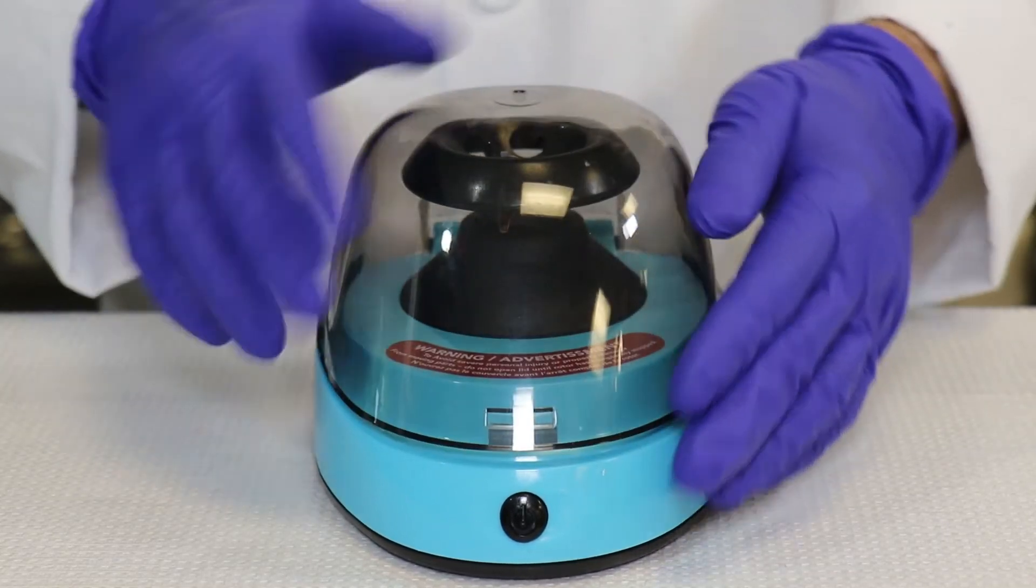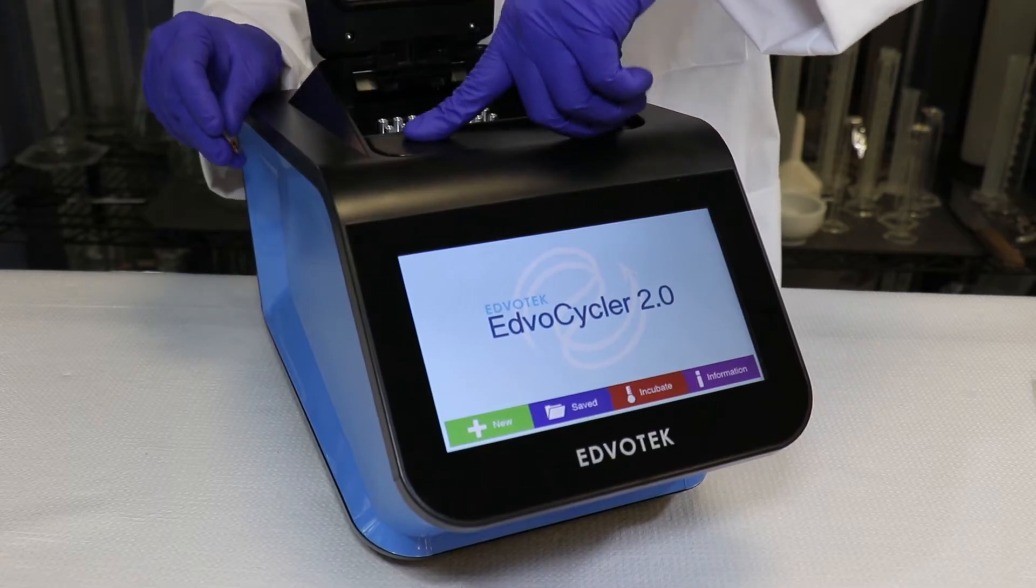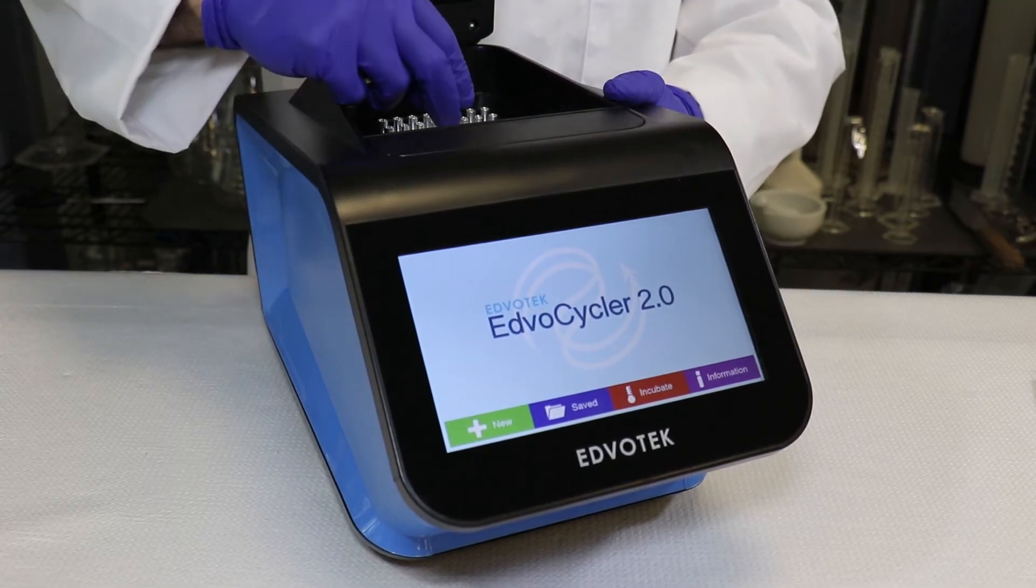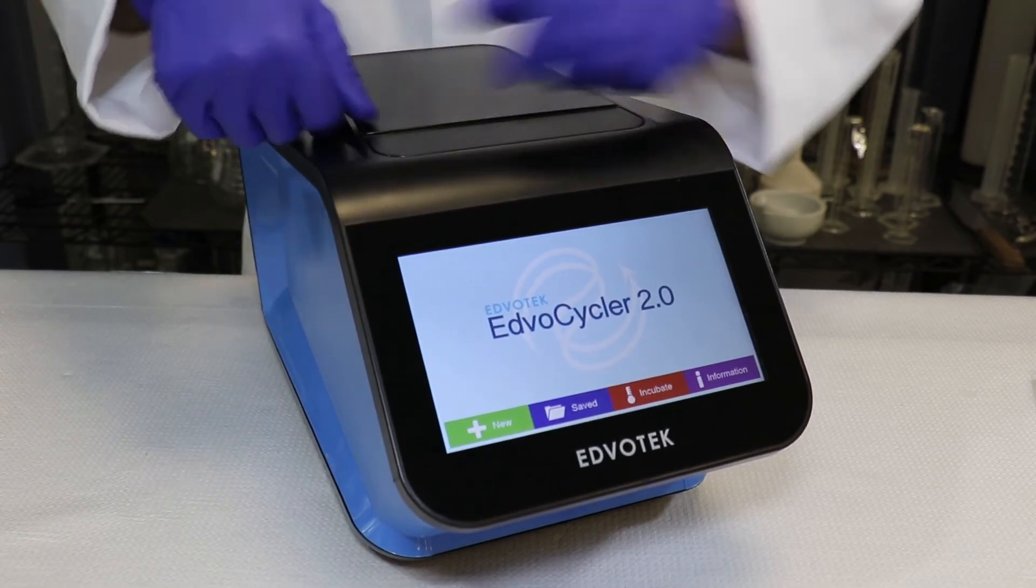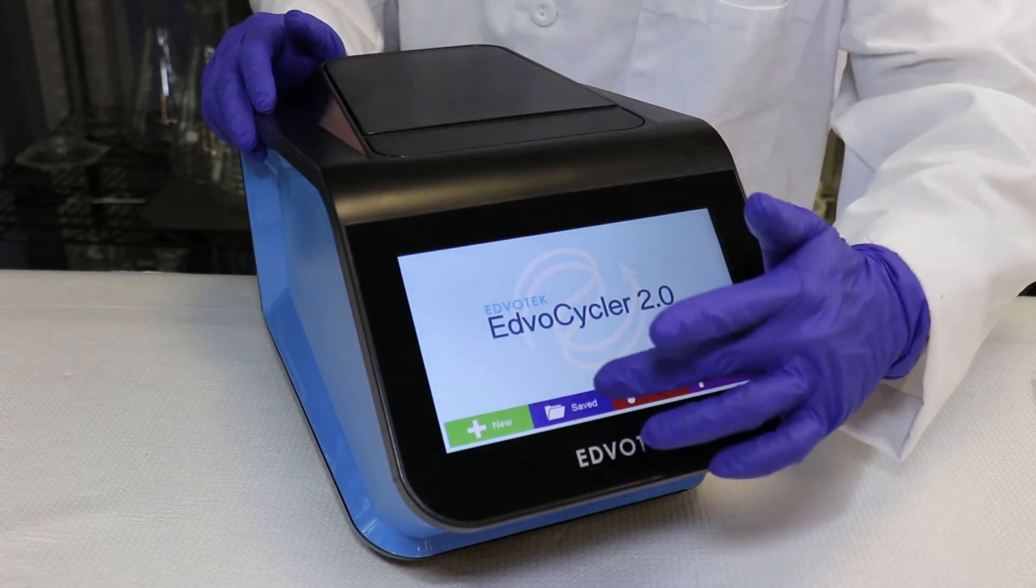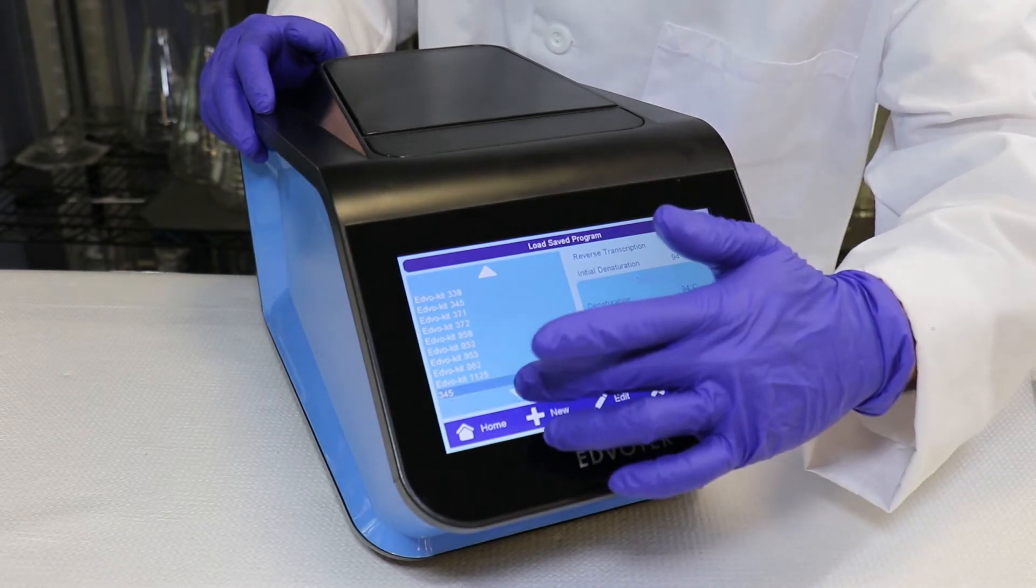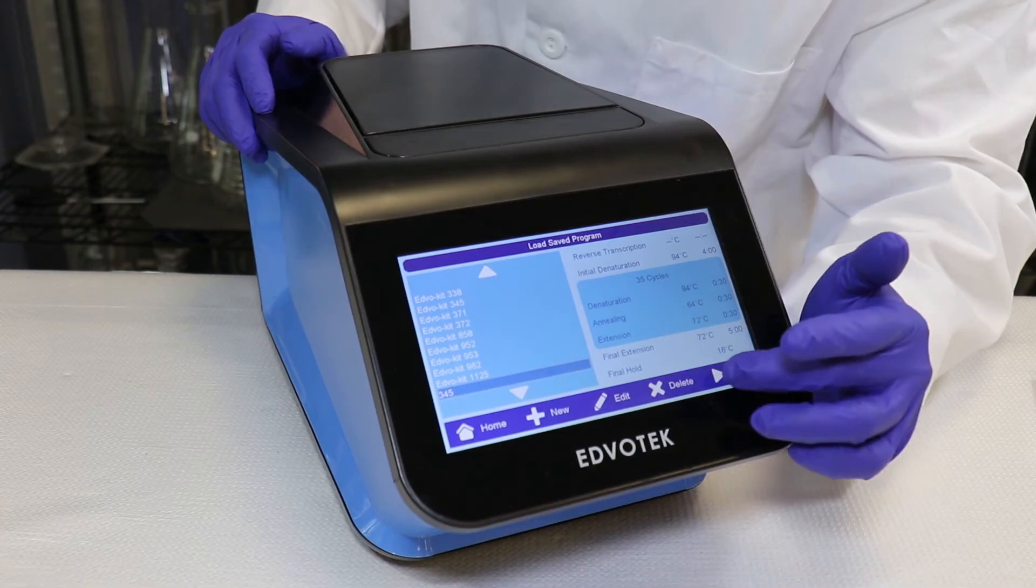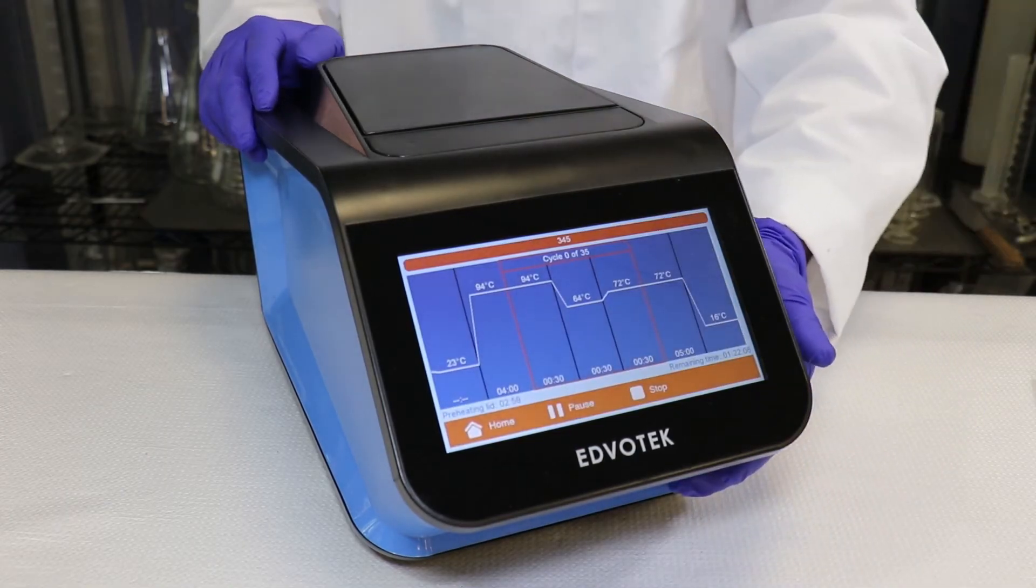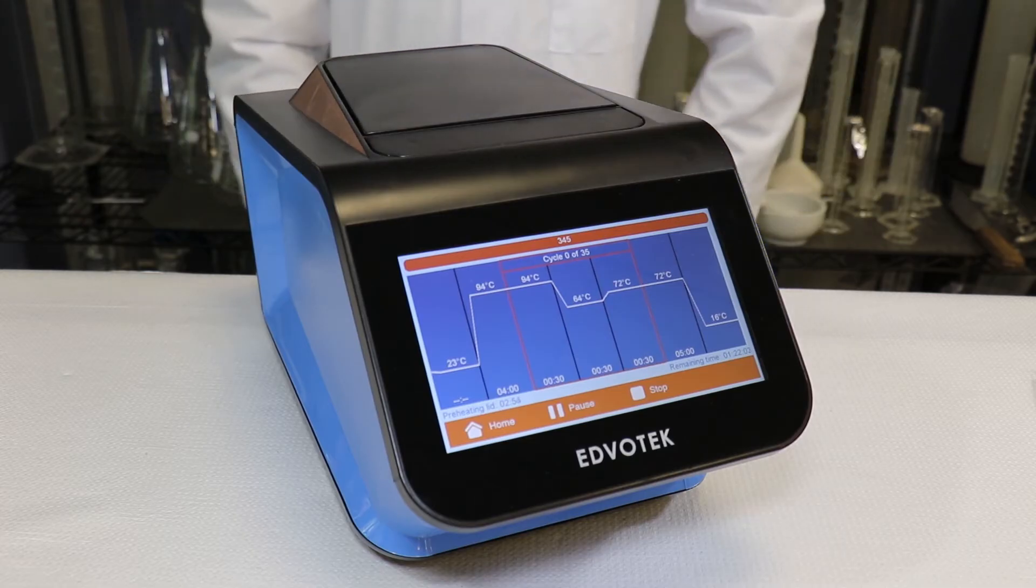Step 5: Centrifuge the tube for a few seconds to collect the sample at the bottom of the tube. Step 6: Amplify the DNA using the following PCR conditions: Initial DNA denaturation at 94 degrees Celsius for 4 minutes, 35 cycles at 94 degrees Celsius for 30 seconds, 65 degrees Celsius for 30 seconds, and 72 degrees Celsius for 30 seconds, with the final extension of 72 degrees Celsius for 5 minutes.